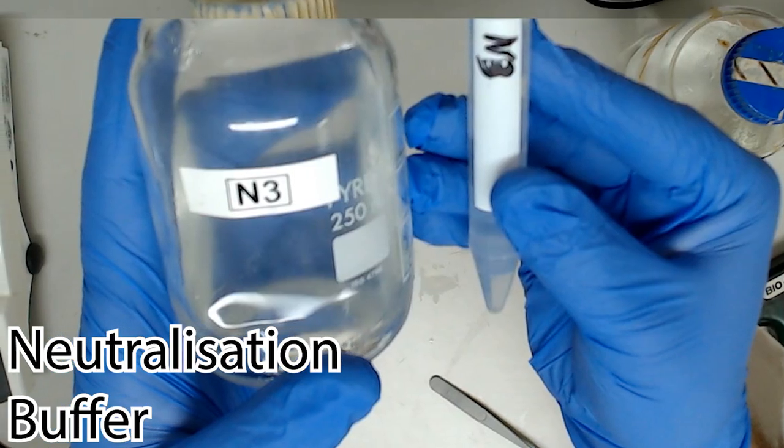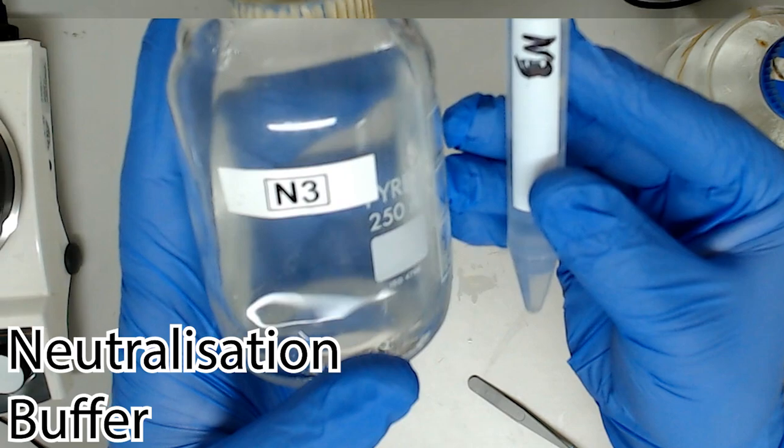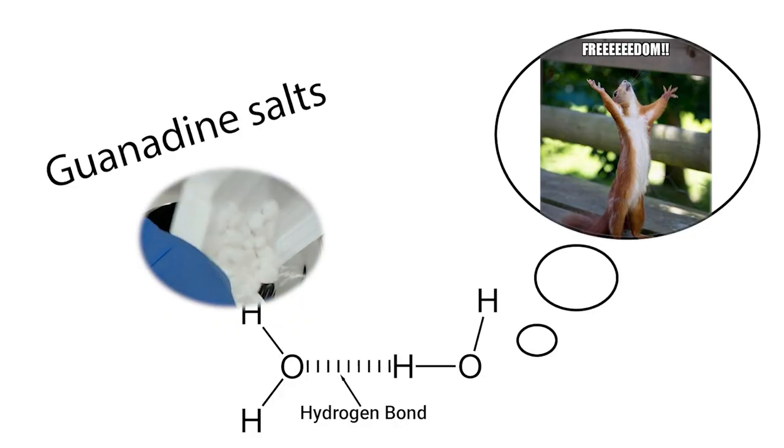When you add the neutralization buffer, the effect is immediate and viscerally satisfying. A thick precipitate will jump right out as the chaotropic guanidine salts freeze the lysed cellular material from its hydrogen bonds.